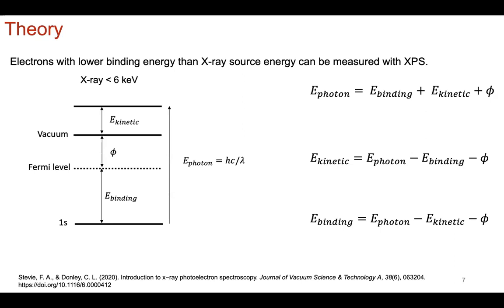So if you're working on liquid electrolyte, looking at decomposition products of the carbonates, you look up other carbonates because people have done carbonate calibration, and say, if I only had carbonate, what would the full width half maximum look like? Thus I can constrain it and not just have a broad peak where I say, well, I have some. So there's a lot of sensibility and reasonableness that goes into it.